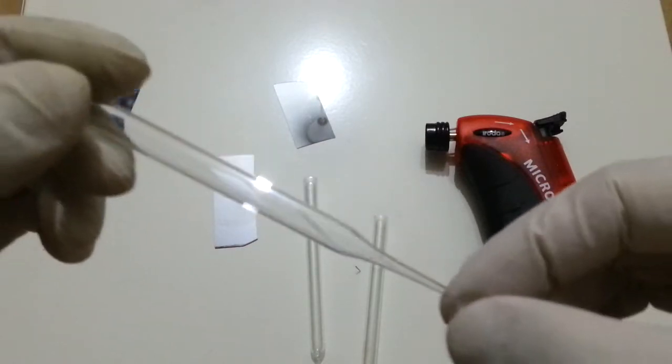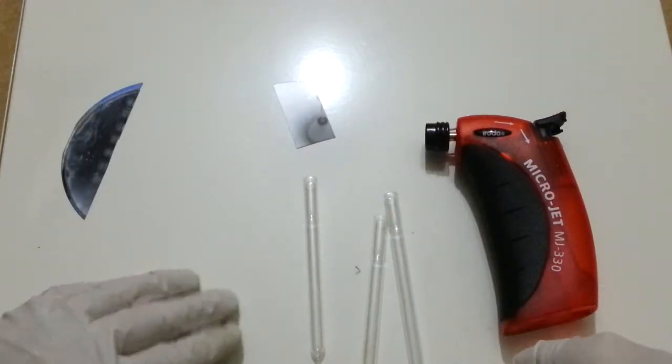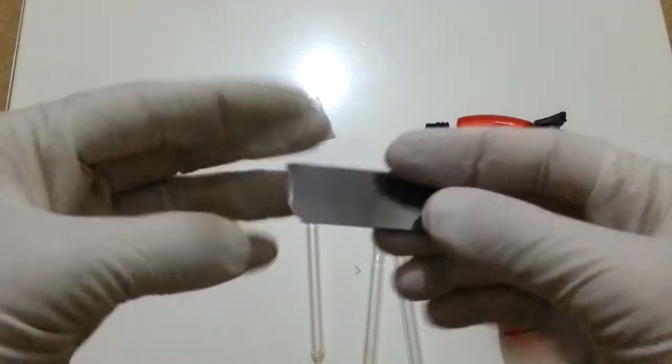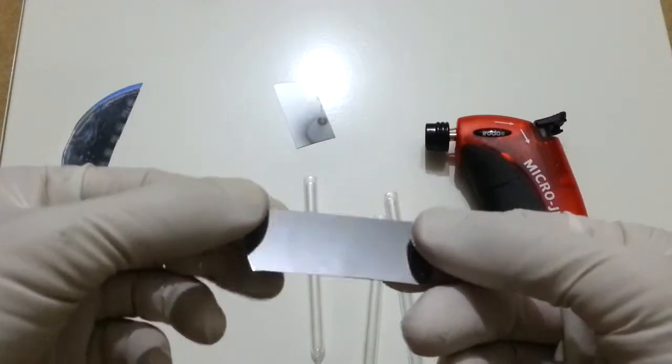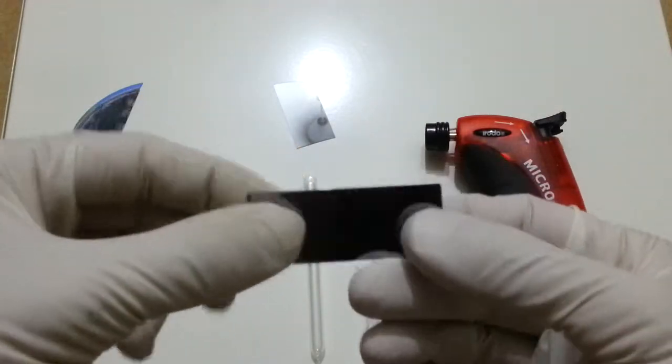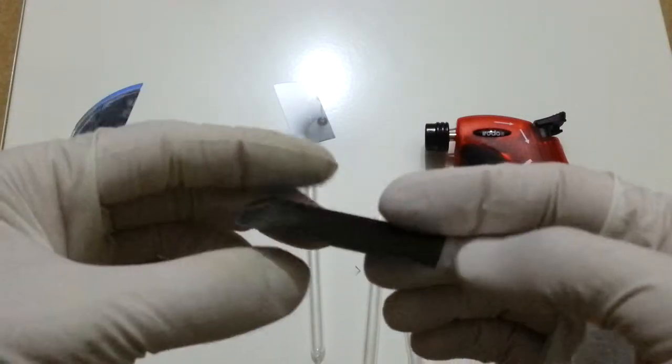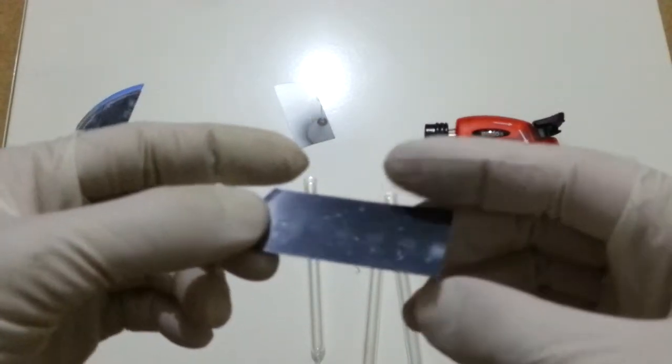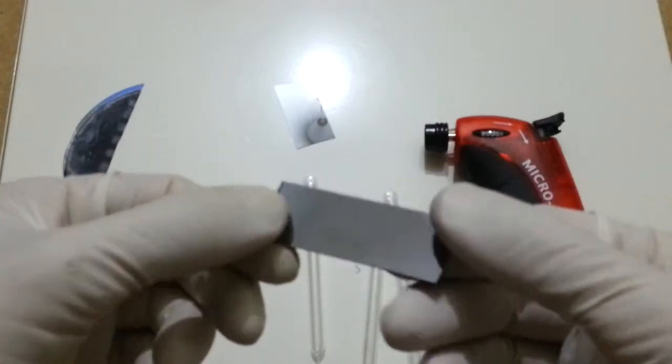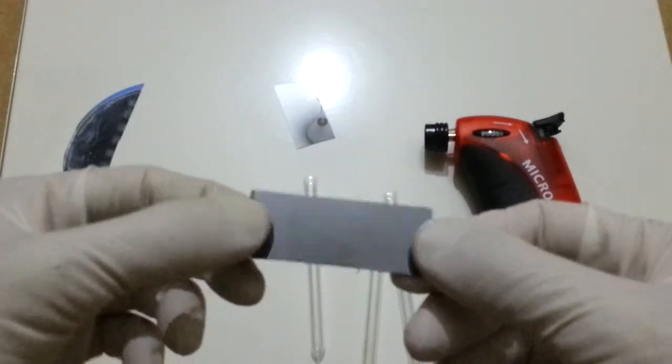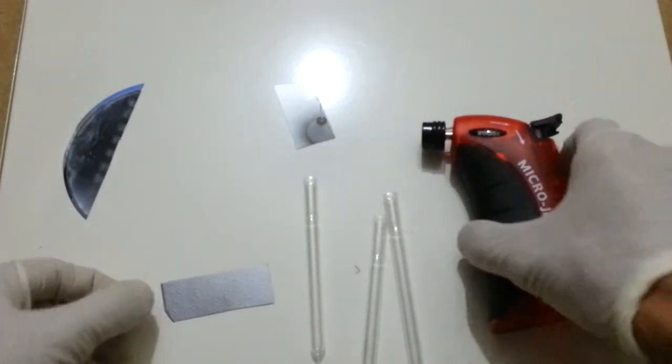You will need a diamond tip or a discarded piece of silicon wafer. This works just fine, costs nothing—of course it is trash—but it can cut the glass. Silicon is much harder than glass.